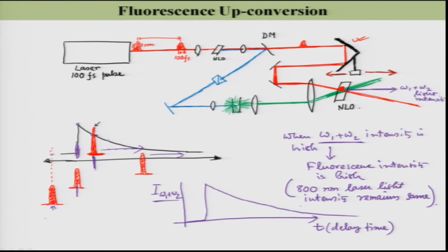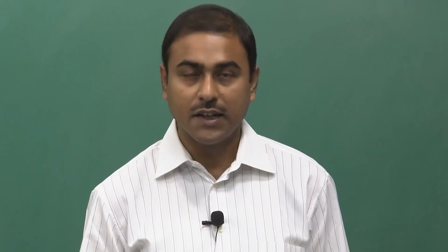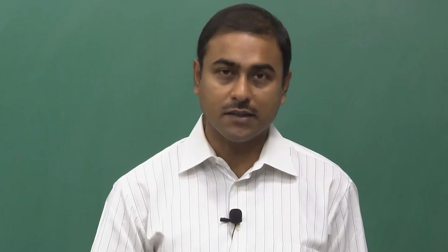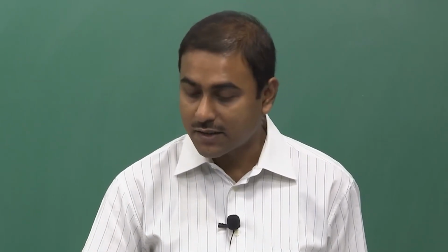That is it. So, in this case, what you are going to see is that the time measurement is being done by the distance. There is no electronics involved for the time measurement. For the time measurement in TCSPC, the electronics part, the detector itself, was involved. The CFD was used to reduce the time jitter induced by the amplitude jitter of the PMT. So, those electronics parts and the TAC were working as a stopwatch, but here the time measurement is being done by this delay stage.